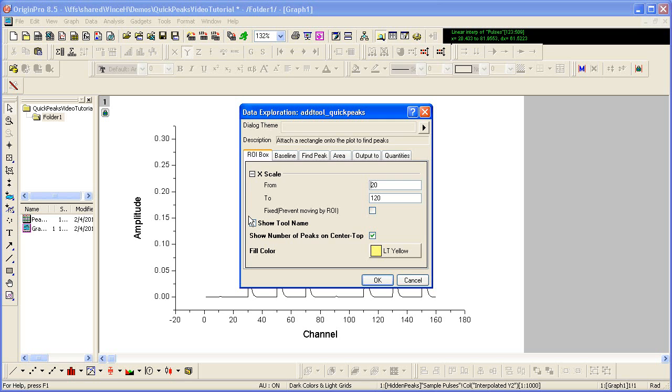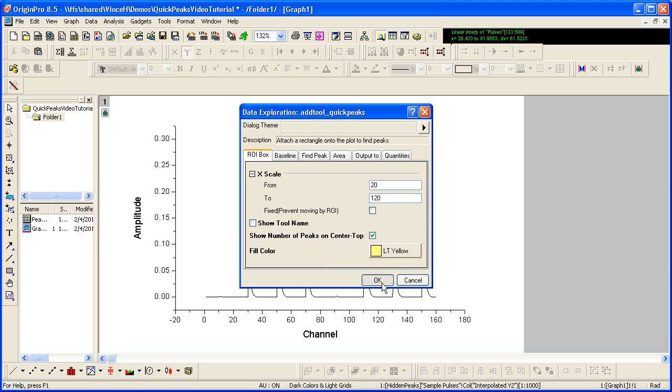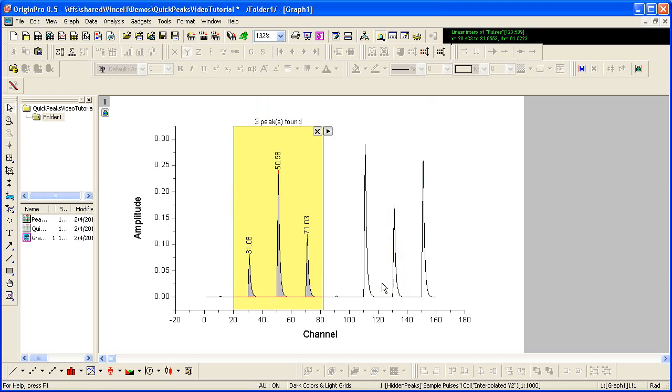A dialog opens with several tabs on which you can select your preferences for the tool. I will accept the defaults by clicking OK to quickly place the gadget on the graph.